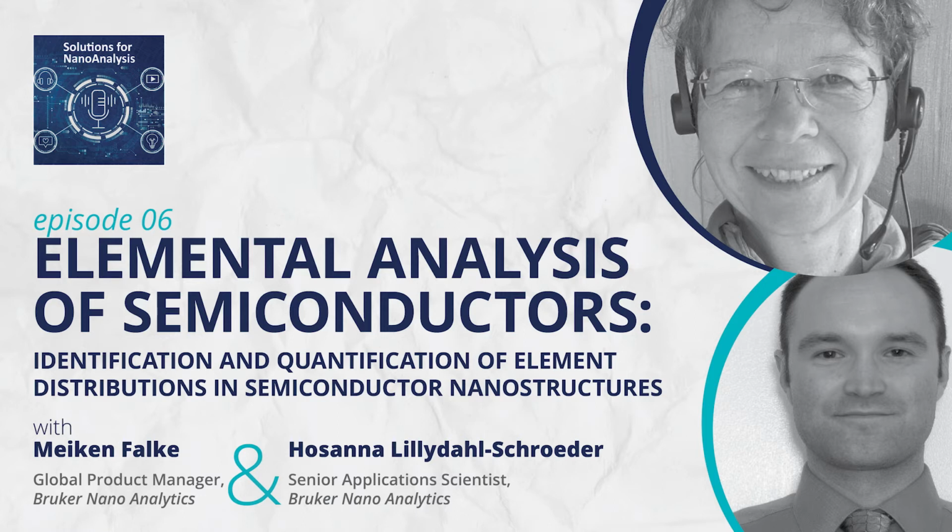EELS is very uncomfortable to use when you want to have an overview of all the elements present in a sample. And that's where I realized we can't do everything with EELS. And then still, I never imagined that I would be working for a company producing EDS systems and EDS tools. But now, since I joined in 2008, I realize how powerful EDS can be, particularly when analyzing a mix of all sorts of unknown elements.